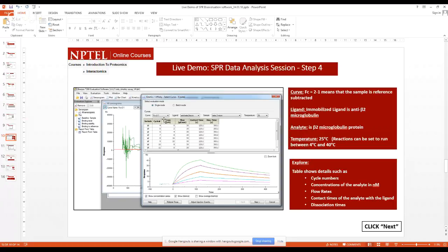If anything apart from the ligand binds, if there is something in your buffer, if something binds non-specifically to your surface, you need to know that the measurements, the RU units that you're getting, are due to your ligand alone and not due to any kind of non-specific binding.